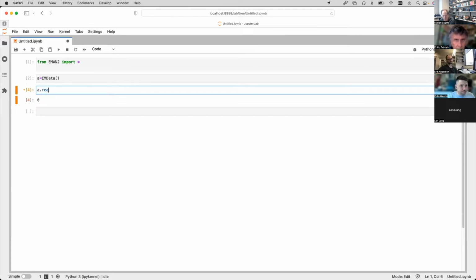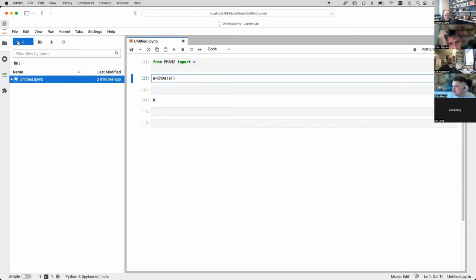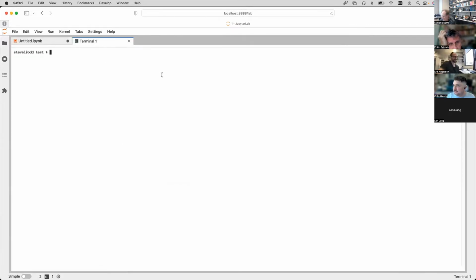a.read. Actually, I don't know if I have any images in this local folder. Let's see. Oh, that's not what I meant to do. I could email you some line images. Okay, I'm just kidding. Okay. So I have nothing in this folder.